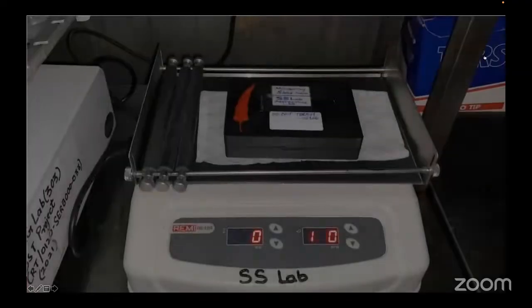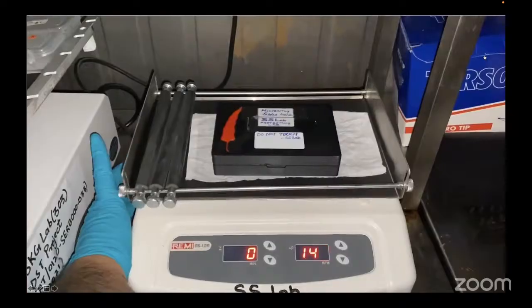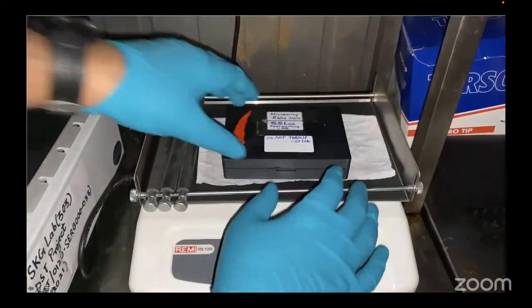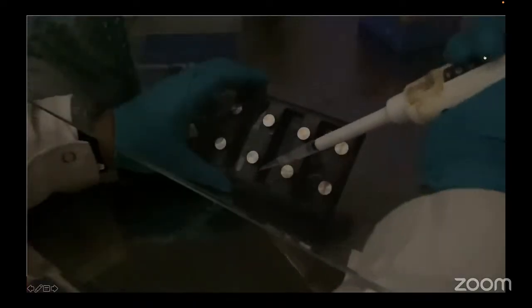On the next day, remove the incubation tray from 4 degrees Celsius and aspirate the solution. Now add washing buffer thrice onto the chip. This step is done 3 times in the dark.